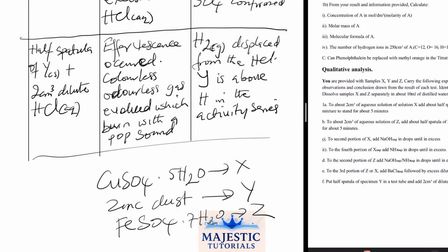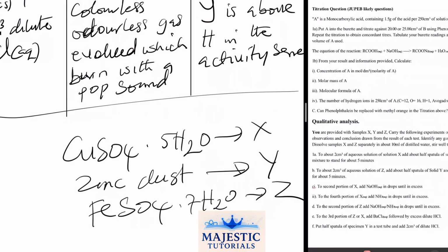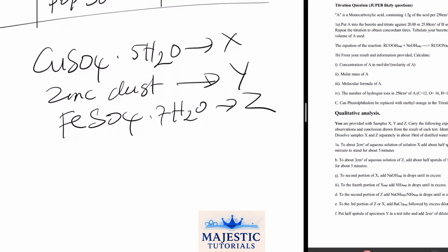So for hydrolysis, both salts here, which are these and these, they all hydrolyze in water to give an acidic solution because they are all formed like this. If you use litmus paper, it will turn blue litmus paper red, while this one will also turn blue litmus paper red, which means they all give acidic solutions due to hydrolysis. So what if we are required to heat? If the experiment will need us to heat, but I don't think they provided any means of heating, but maybe to prepare you against all odds.